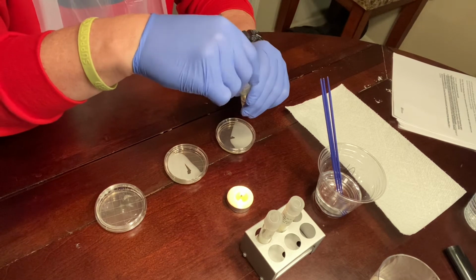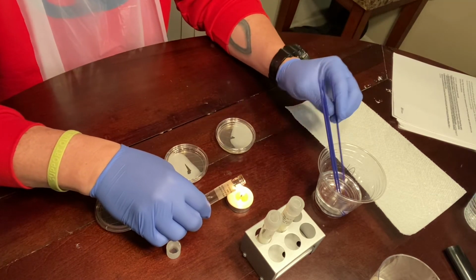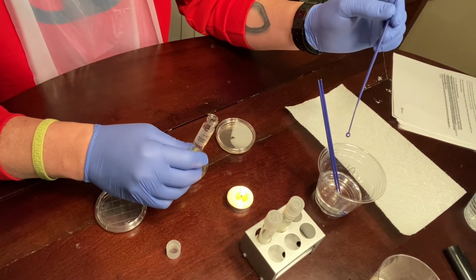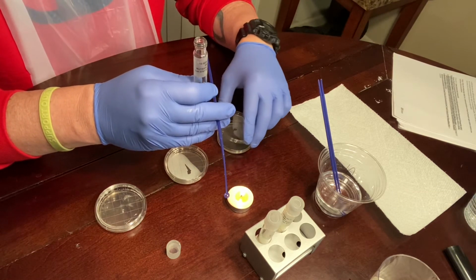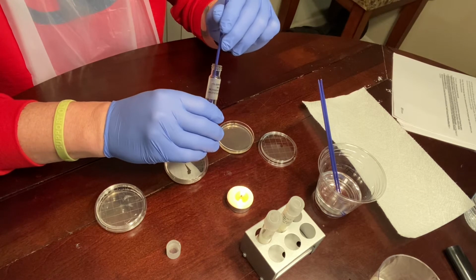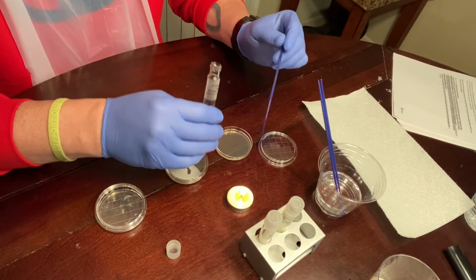So I'm going to remove the cap. Sterilize the lip here. Careful not to touch the lip. I just transfer in a zigzag motion here to 4 separate quadrants.